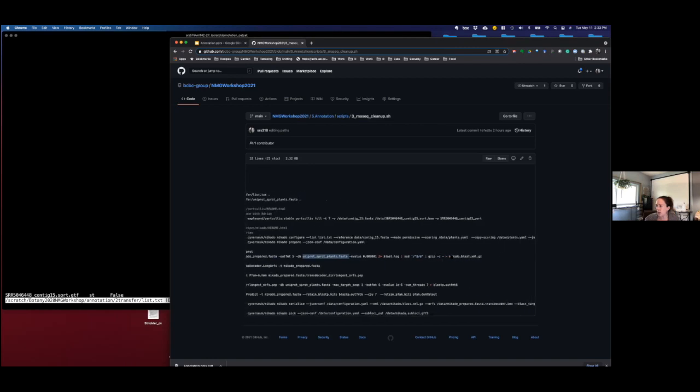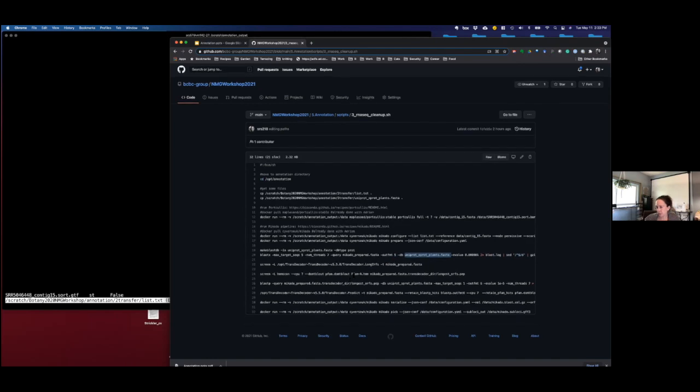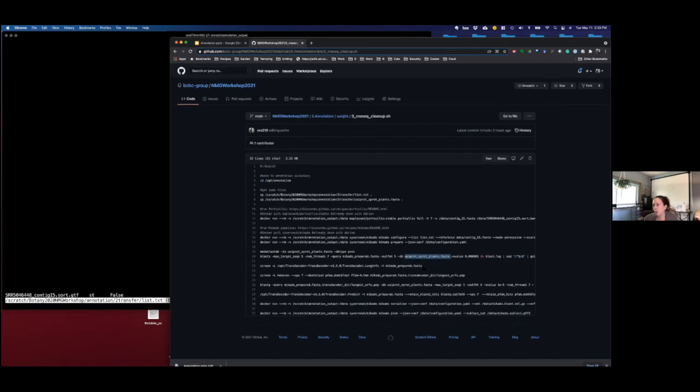And it generates some BLAST output that you use later on in filtering. Some of these steps are optional too. If you look at the documentation, you don't necessarily need to run HMM scan, but I think in general it just gives you a little bit more certainty about whether those predictions are likely to be real coding genes. So they're good to do.